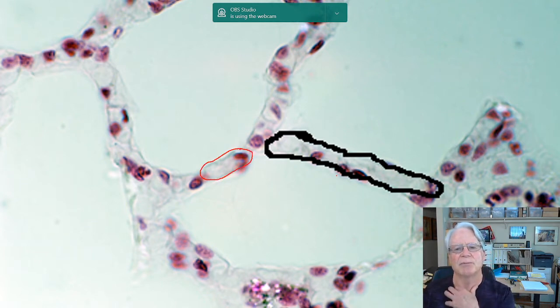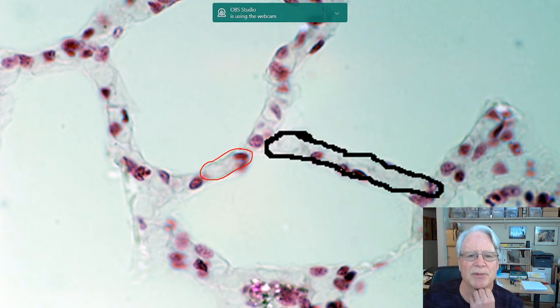This is an image that I took through a microscope that I have, and this is a cross section of the lungs. This is also showing your respiratory membrane. The blood vessels, capillaries, are not seen in the image. They're too small to be actually identified. There are capillaries infusing this whole area, and air is moving.